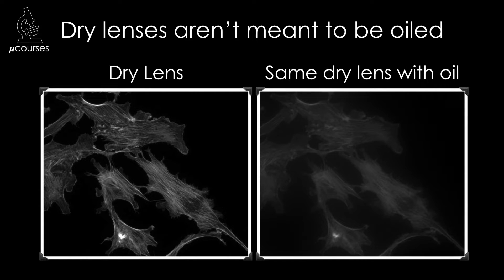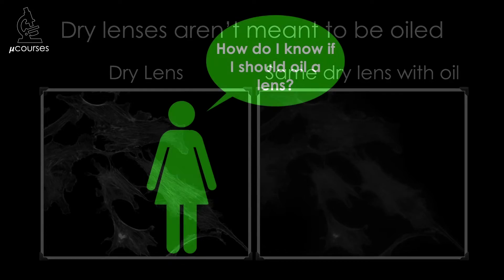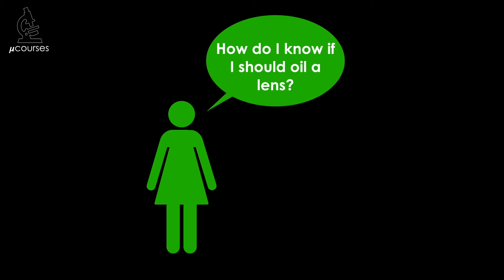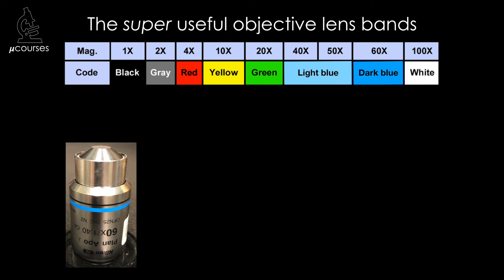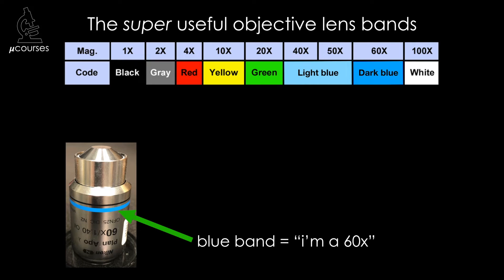Image quality will suffer greatly if there's any immersion oil on a dry lens. So you might be wondering, how do I know if I should oil a lens or not? There's actually a really useful banding system that all of the major microscope manufacturers use on their objective lenses. An objective lens is marked with a thicker band that tells you what magnification it is — a dark blue band, for example, tells you that this is a 60x objective.